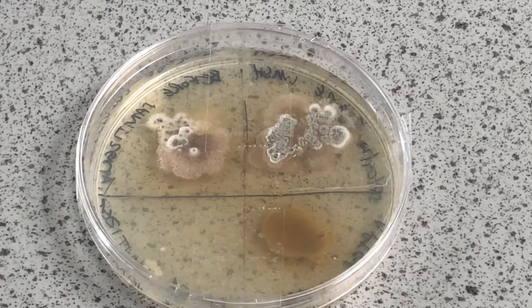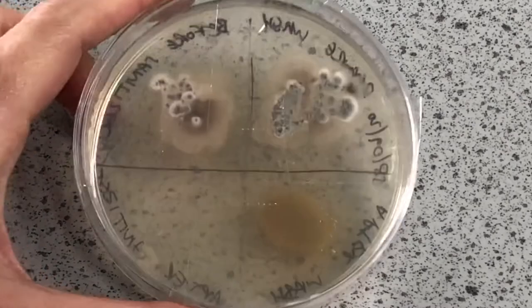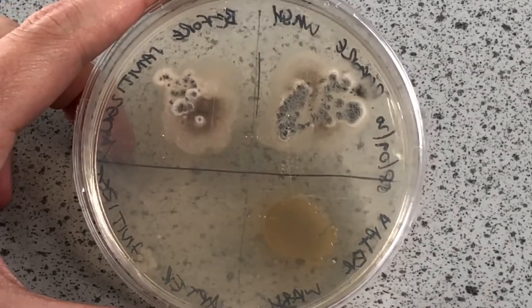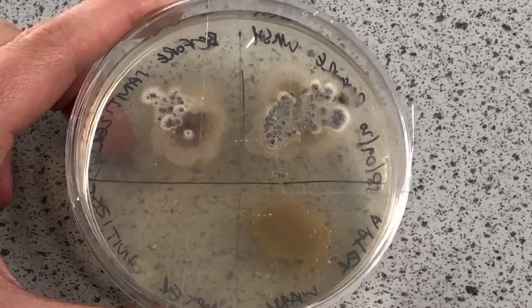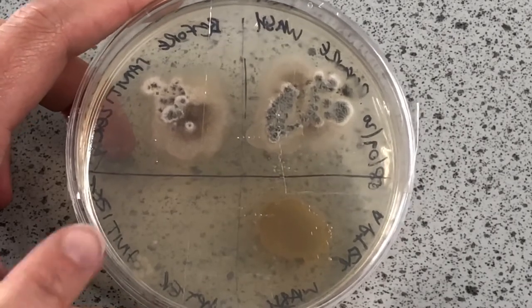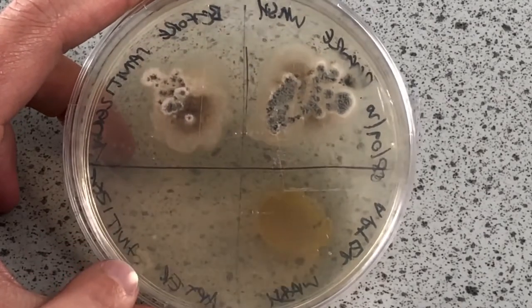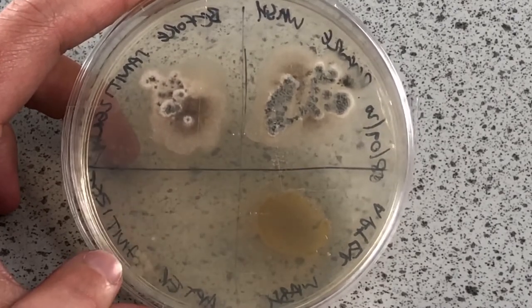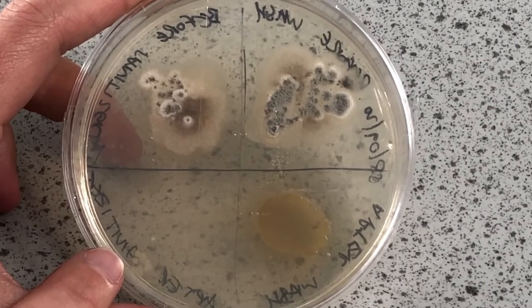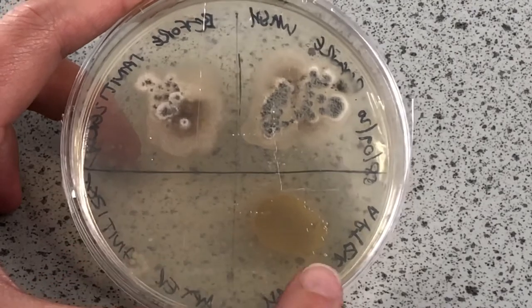Here we've got the results. I set this up on the 8th, it's now the 14th, and we've had some good bacterial growth in our agar plates. You can see the two at the top here are the 'before hand washing' sections — there's lots of nasty bacteria growing there. Interestingly, this section here with hardly any growth whatsoever, just a little bit at the bottom, is the hand sanitizer.